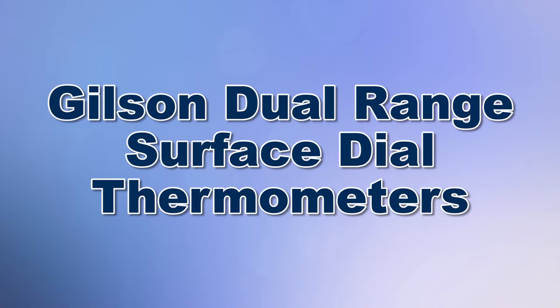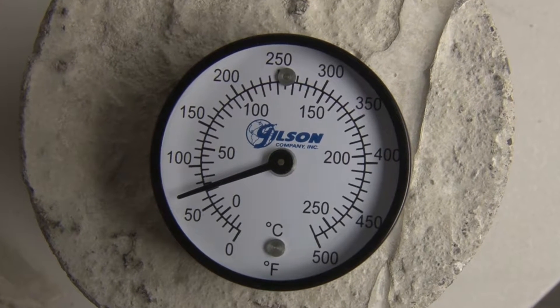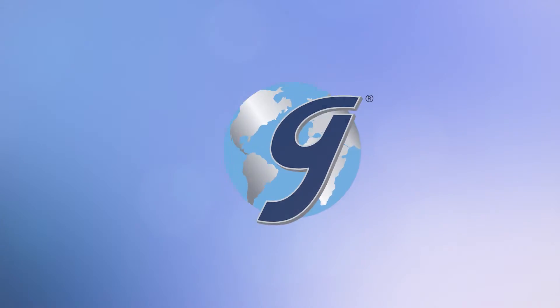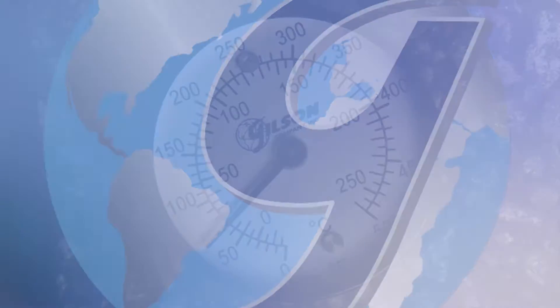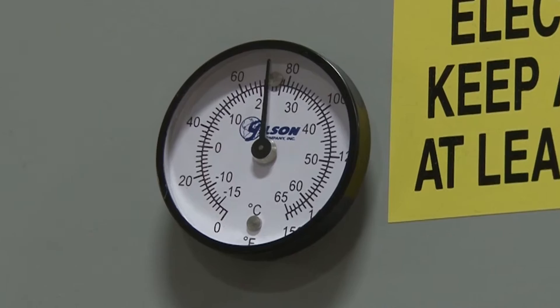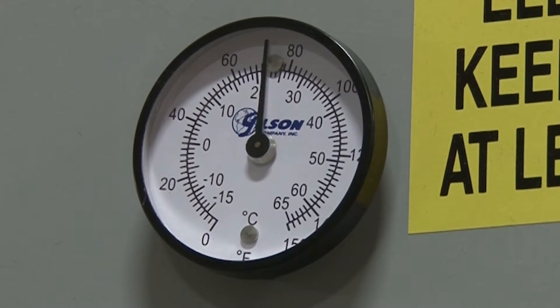When you need an easy visual reference for quick and accurate measurement of surface temperatures, then Gilson is the right choice. The Gilson Dual Range Surface Dial Thermometers are an optimal tool for measuring surface temperatures on contact with any material surface.